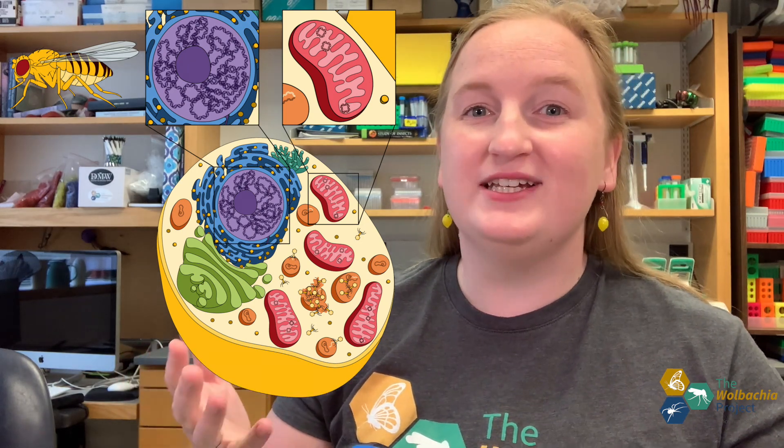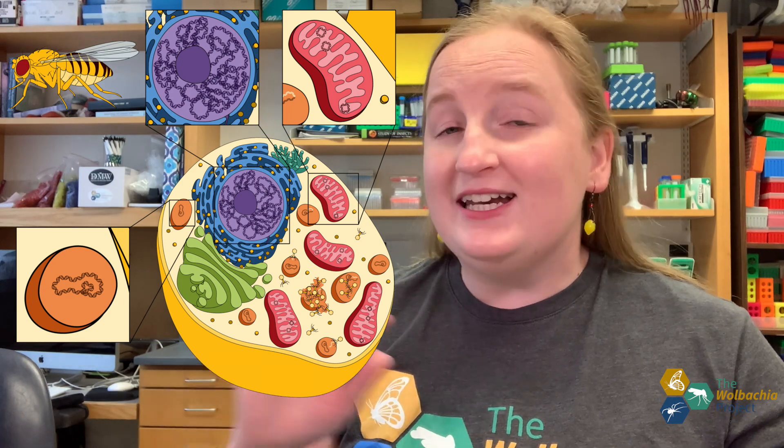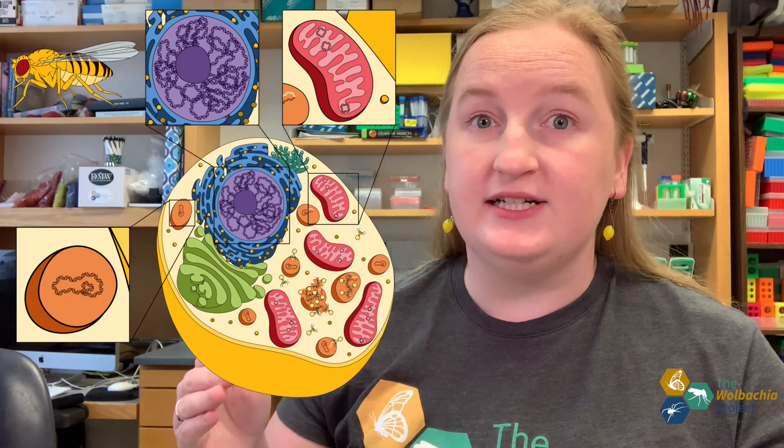Finally, because this is the Wolbachia Project, we're interested in extracting Wolbachia DNA. Wolbachia is a bacteria that lives inside of the arthropod cell, so anytime we extract Wolbachia DNA, we will also be extracting arthropod DNA. Wolbachia is concentrated in the reproductive organs of the arthropod, so we'll be focusing on the abdomen, where the reproductive organs are located, when we prepare our sample.